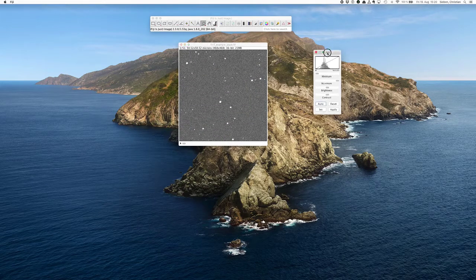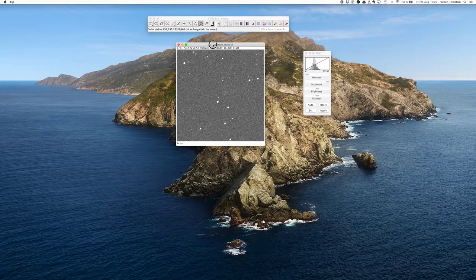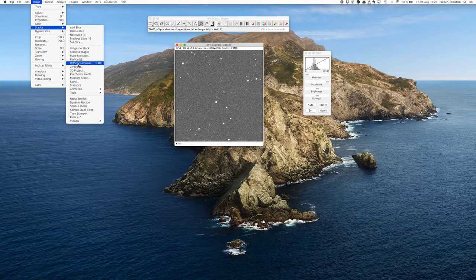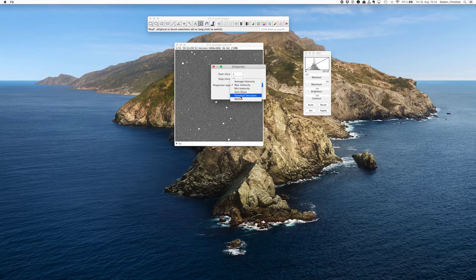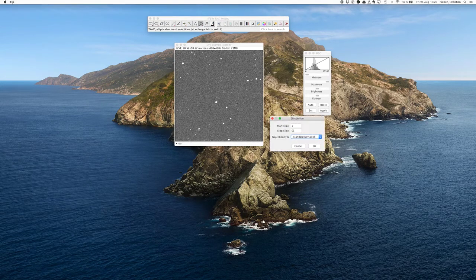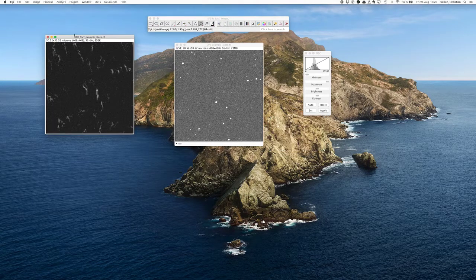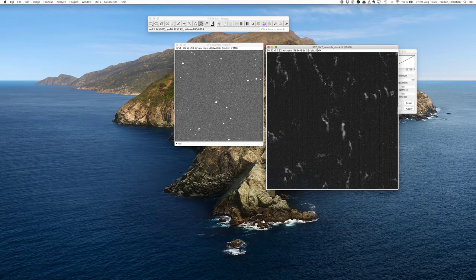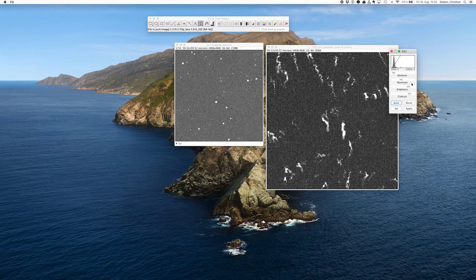Before we go into Trackmate, I just want to show another option to visualize particle trajectories. That is by forming a Z project. So we go into Image, Stacks, Z project, and we look at the standard deviation, which I find is quite useful to highlight the individual points per frame with a high contrast. And what we get is a projected view of the particle movement, which I think is quite useful. You can see that the particles move in this snake-like way across time.